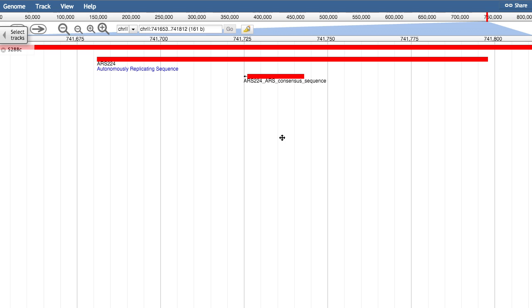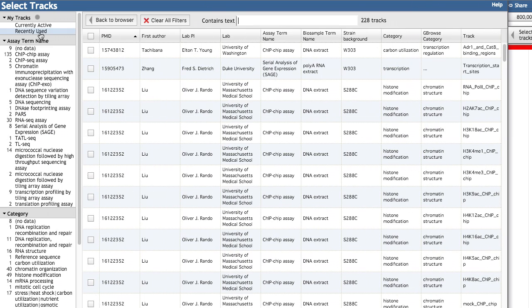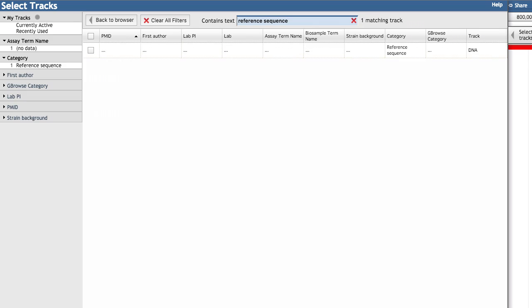If you don't have the Reference Sequence Data Track enabled, click on the Select Tracks button, enter Reference Sequence in the search box, and enable the track by clicking on its checkbox.